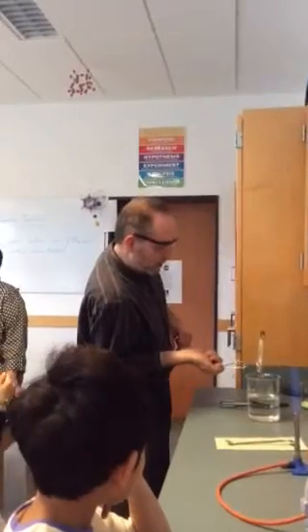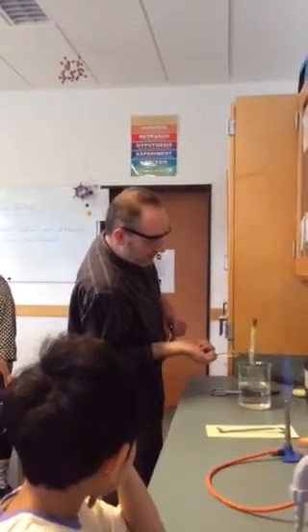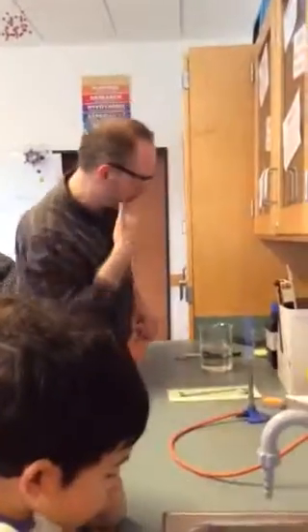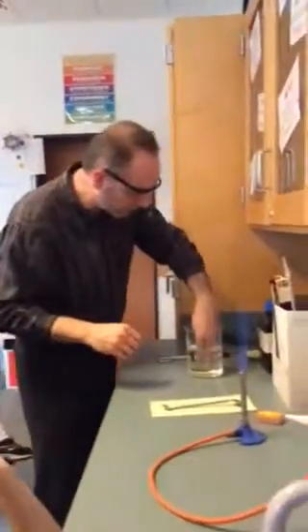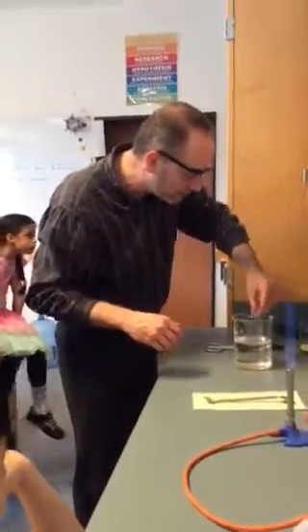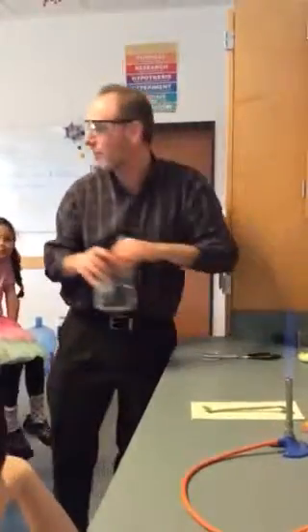Let's try that one more time. And I have a few little beads of it, so well, that's okay. Do not reach in and touch that. That is quite hot. And I am going to pull out for you some little beads of sulfur. Actually, we're just going to set it on the table.